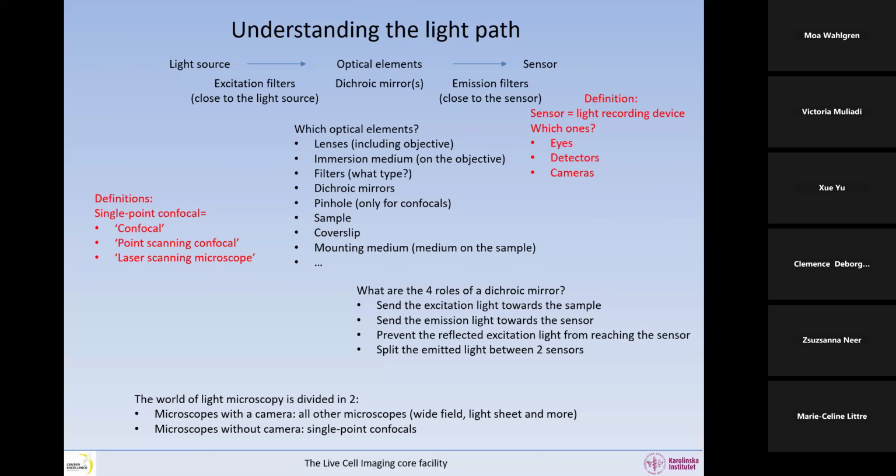So all these things in this course, we're going to call them single point confocals. The reason is that I want to differentiate this from multi-point confocal that I'll talk about later. And when we say wide field in this course, we're talking about a system with a defocused illumination. So single point confocals have a focused illumination, and wide field has a defocused illumination. And that's what people call a standard microscope.